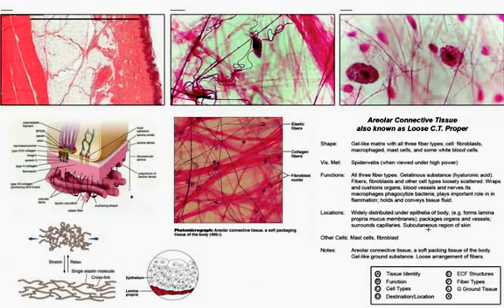Okay. Underneath those epithelial linings here we have what we were just looking at. This is a great view right here of the skin that covers the surface of the body. And you can see keratinization here and the dead cells sloughing off. I'm not sure where it was taken from, but because of the layers here, it's been cut from superficial to deep through the layers of the keratinized stratified epithelia. Keratinized being dead layers, so the surface of the body.